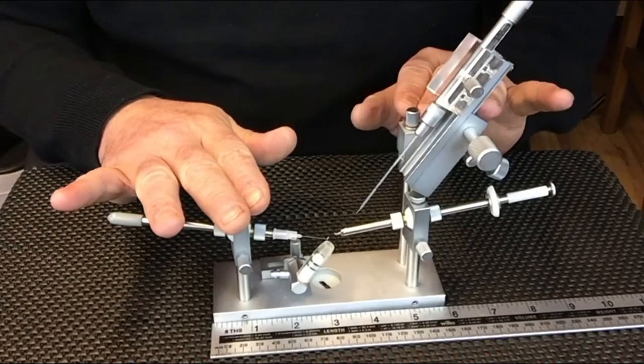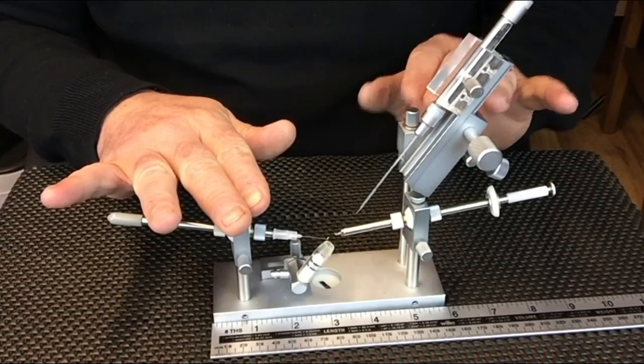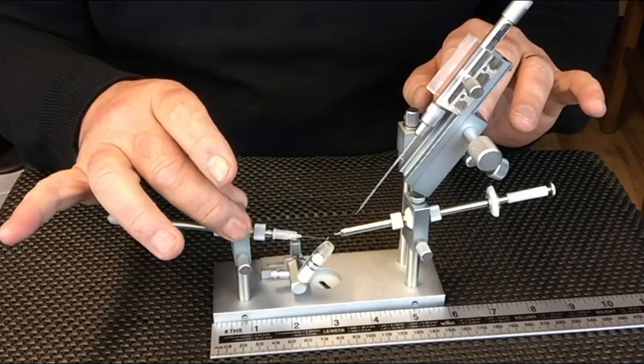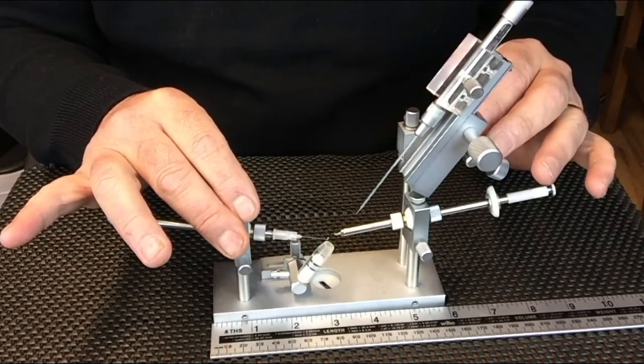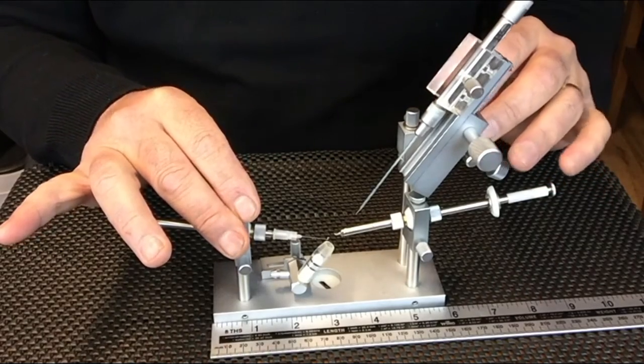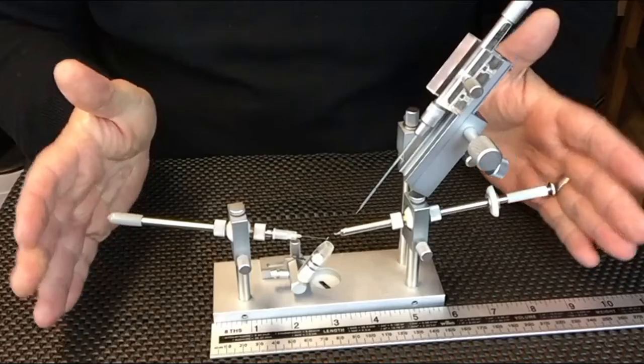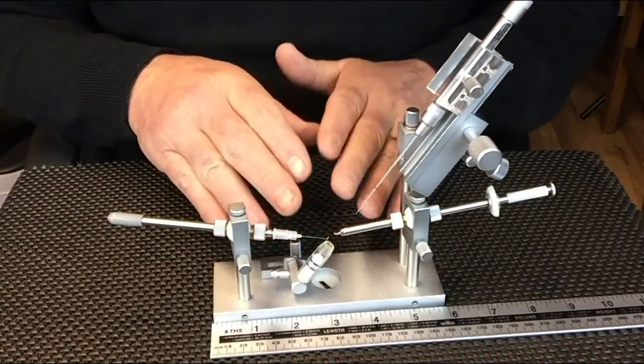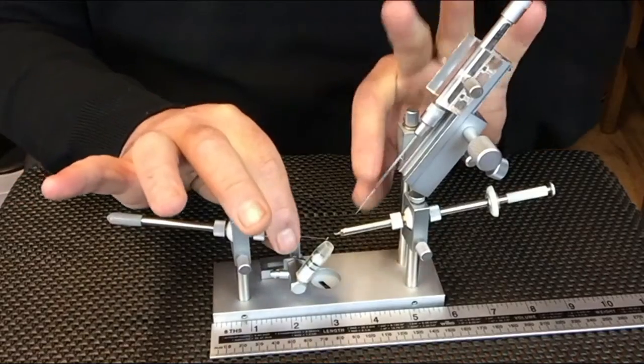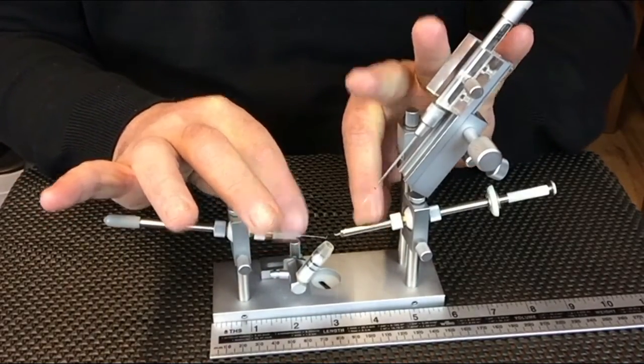The main difference between the 101 and the 102 is that the pillars on the 101 are fixed and can't be moved in and out like they are on the 102. The 102 is slightly bigger, so if you have larger hands the 101 can present a few problems, especially if you want to manipulate from inside the pillars.